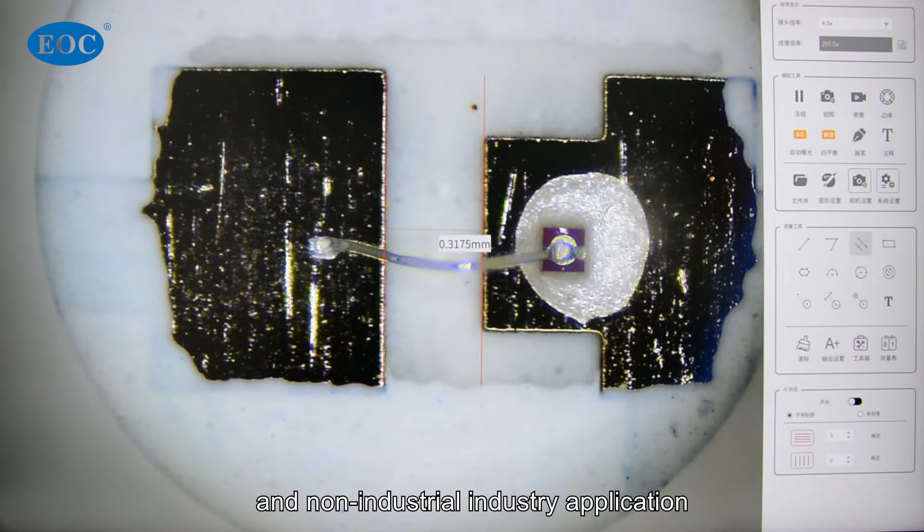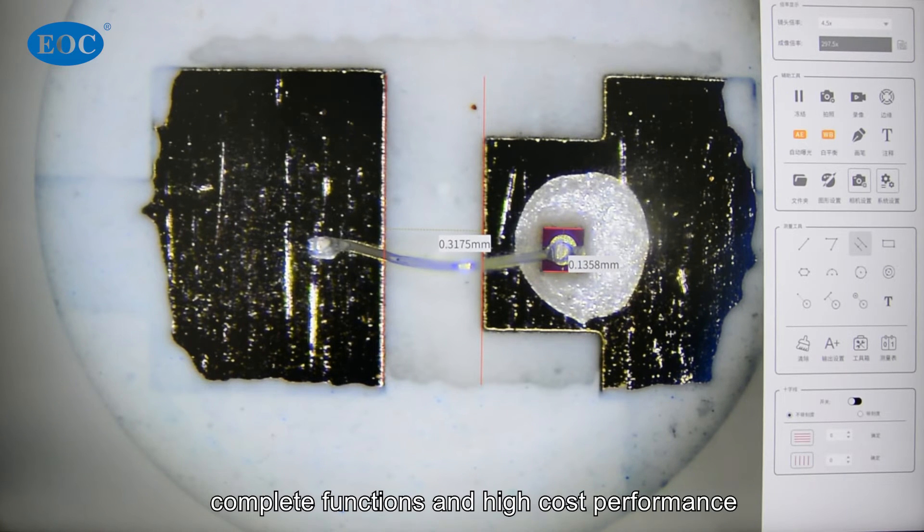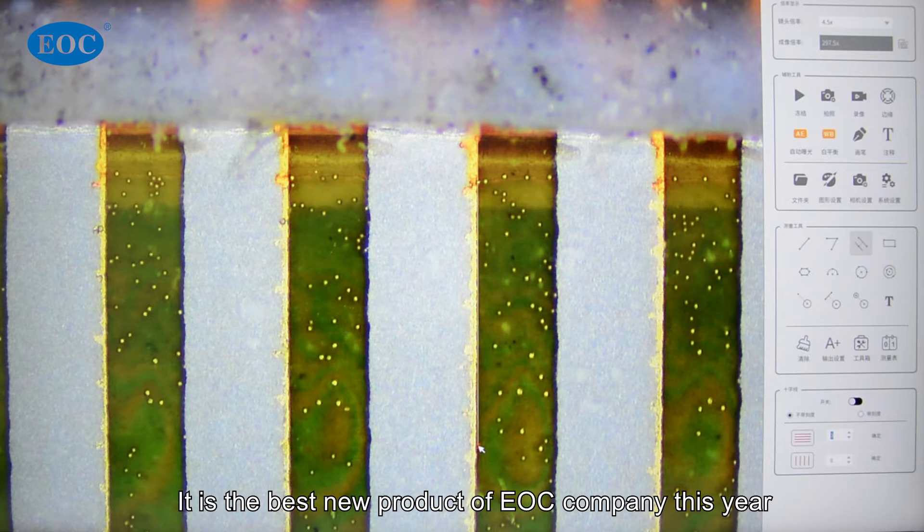It has the advantages of high-definition imaging, complete functions, and high cost performance. It is the best new product of EOC company this year.